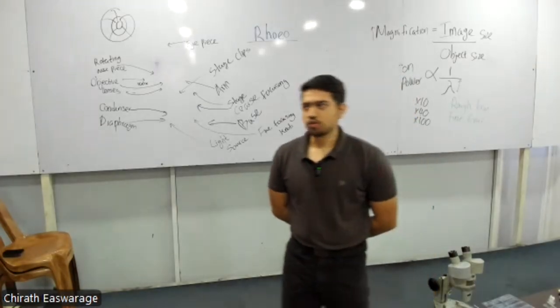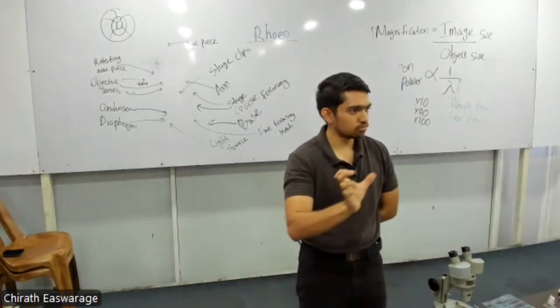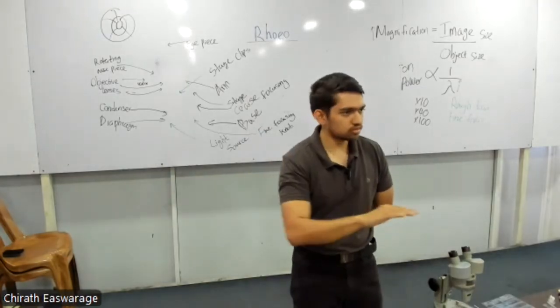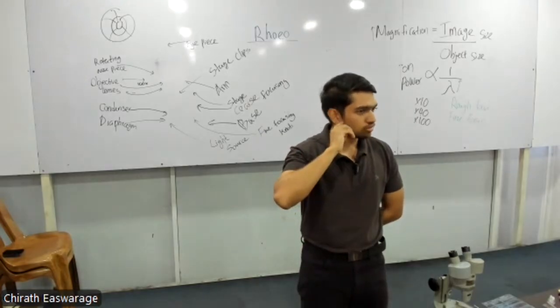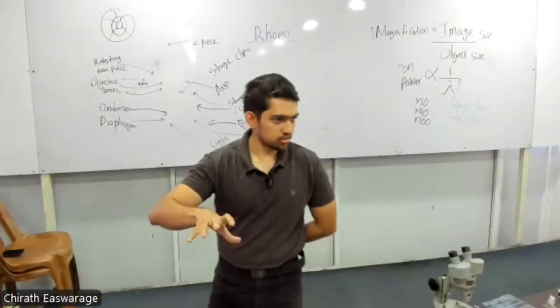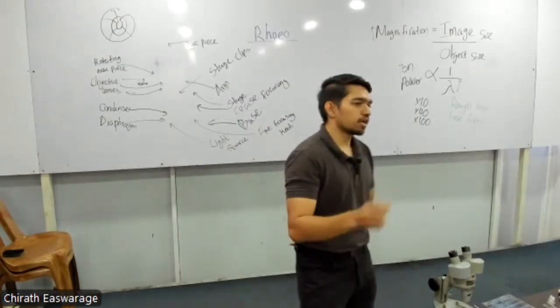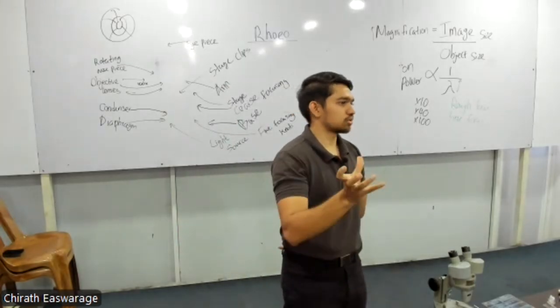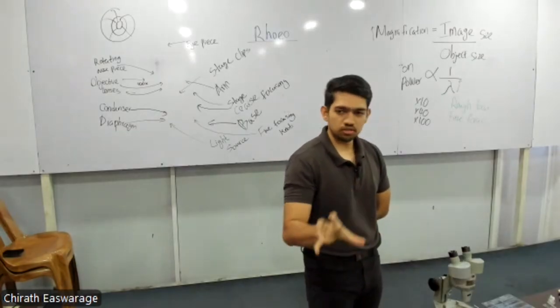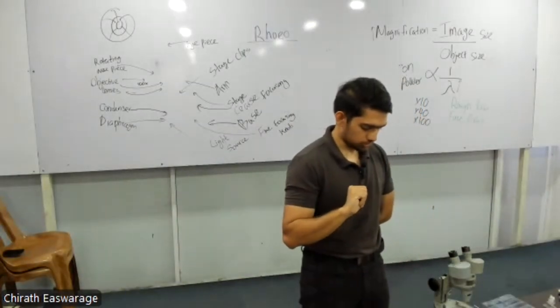Actual color of the image can be observed. What do you mean by color? It's like the different wavelengths in the visible spectrum, no? Blue, red, visible from I think red to violet, the wavelength changes, right? So we can observe that. But electrons will be detected by a sensor in the microscope, and we can give artificial colors. There are softwares for electron microscopy. We can ask them to give colors to certain structures, right? So artificial colors can be put so that we can nicely identify, or for teaching purposes, we can put colors using software. So actual color can never be observed in an electron microscope.